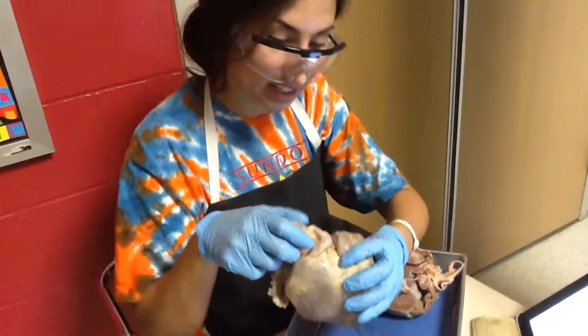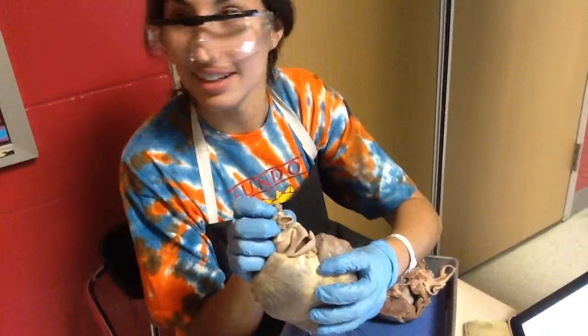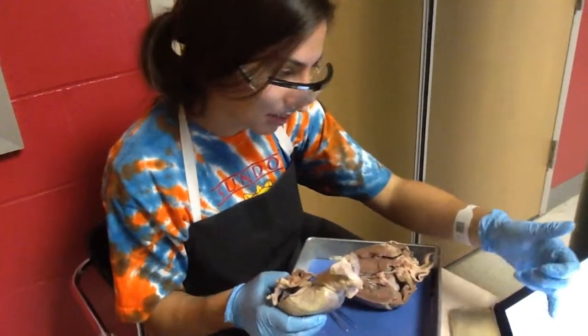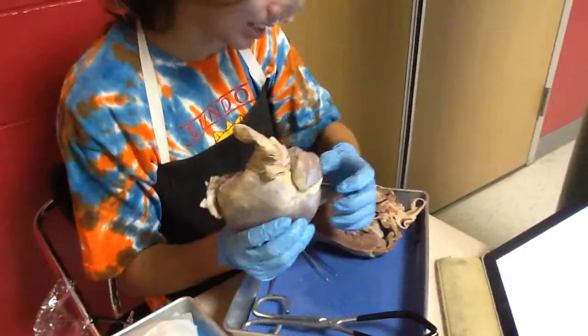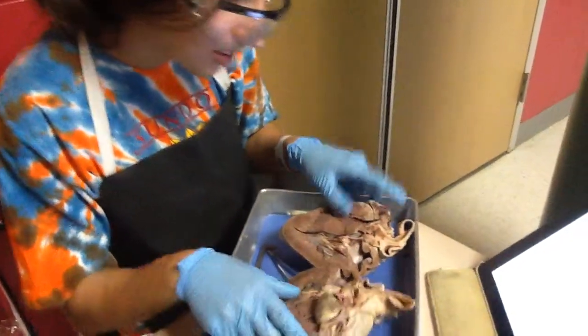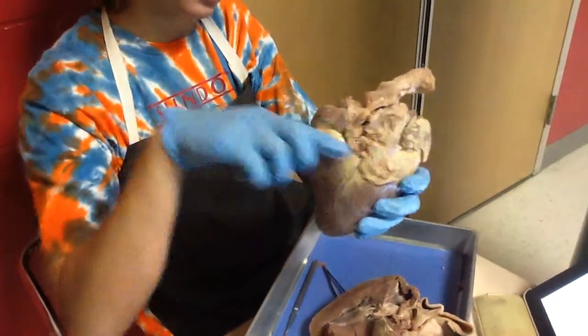Then we have the brachiocephalic, is that how you say it, artery? Yeah. Then back here we would have the coronary sinus. You can't really see it on here. Okay, then on the heart you have the apex region and then the base.